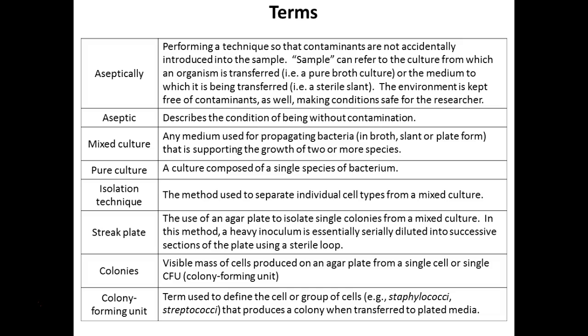Having known that, when you're counting bacteria, your counts would be a little bit low if you're counting a single colony as coming from a single cell, because that probably wasn't the case for these types of organisms. Streptococci, as you will learn as you're doing your homework, form chains. And that infection known as strep throat is just a shortening of the name of the organism that causes that infection. Streptococcus pyogenes causes strep throat.